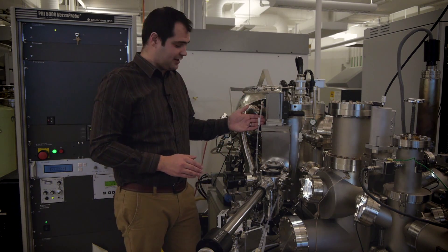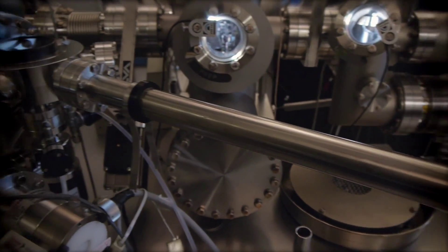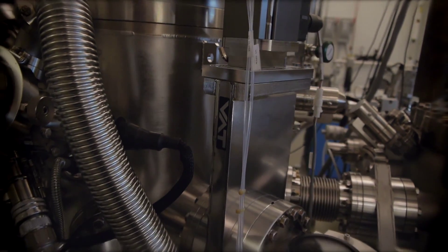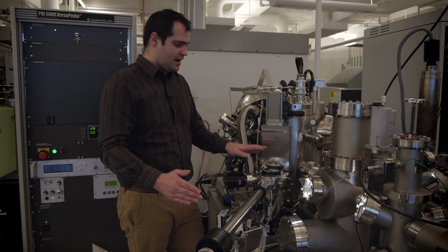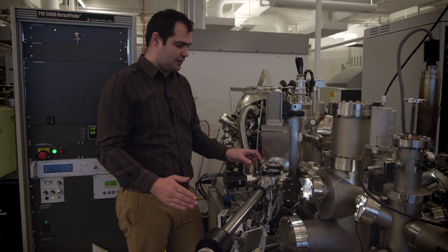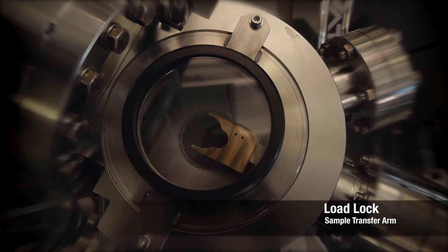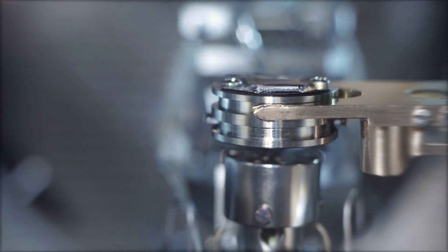Here we can see the chamber separated with a dedicated load lock. This part is where we can close and protect the vacuum on the main chamber side. We can vent this to a dry nitrogen environment — we have a small volume where we can put our sample in, close, pump back down, and our turnaround is very quick.